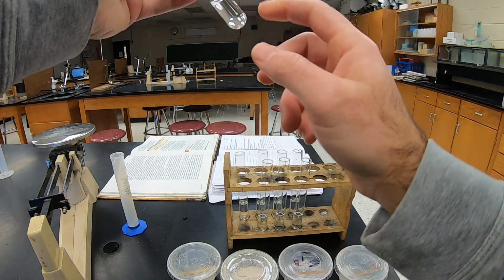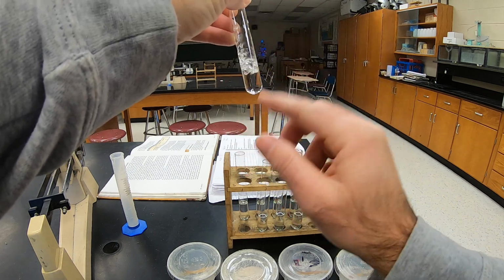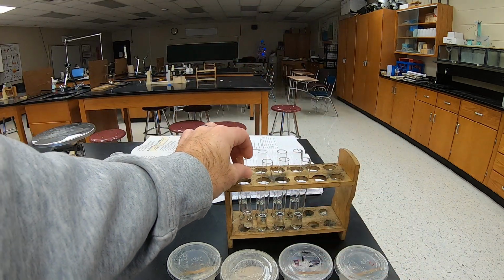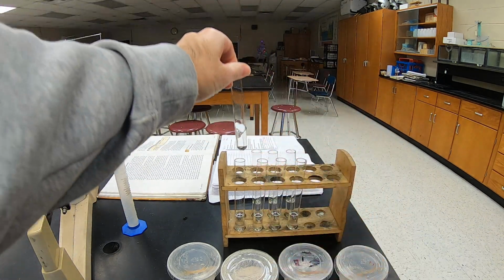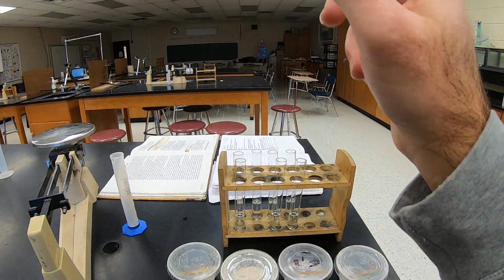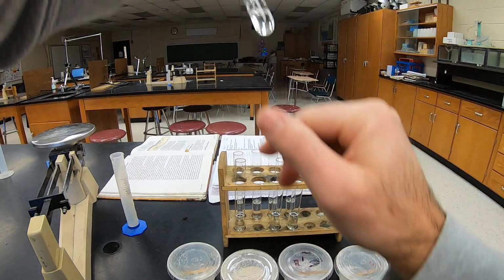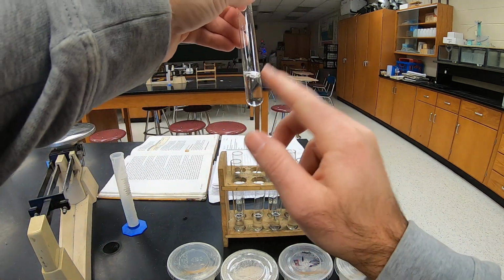And so let's shake these a little bit. And I'm just going to shake each one. And then we'll come back and look at them.